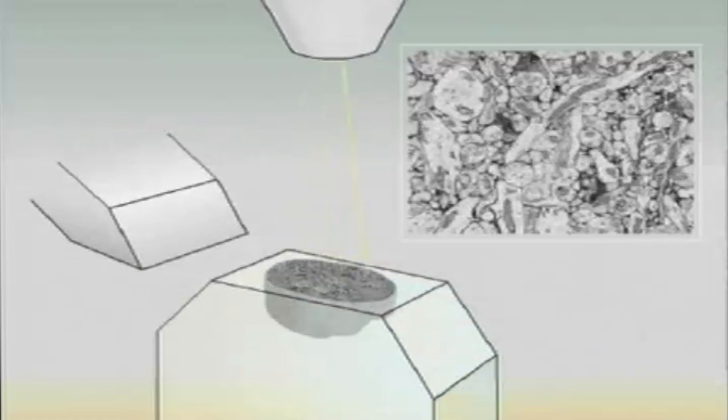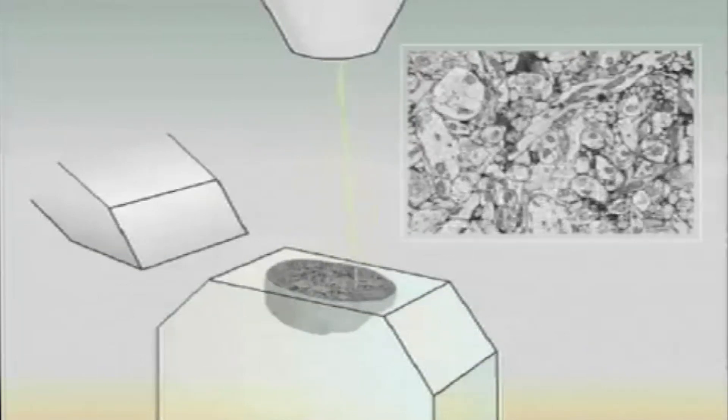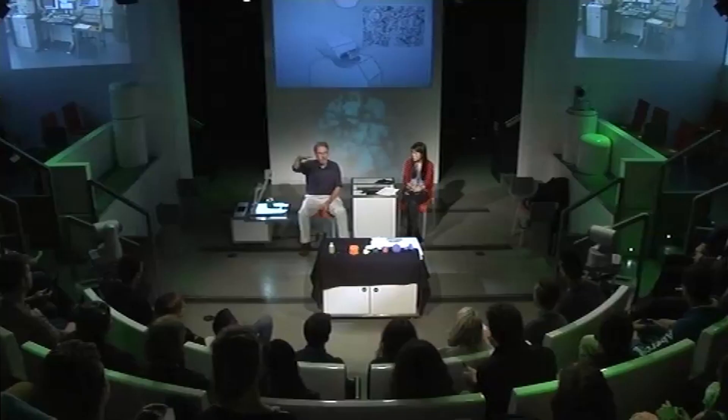Take a lump of tobacco leaf, we fix it with chemicals, dehydrate it, put it in a block of resin, like a household araldite, and then the beam of the scanning electron microscope, scanning across and taking the picture — you can see it taking its picture there — and then we cut a section and throw the section away. We're not interested in it, and we just scan the surface of the resin again. That way we can work our way through the specimen slowly, at about 50 nanometre thick sections, which is very, very thin. A nanometre is a thousandth of a micron, which is a millionth of a metre.